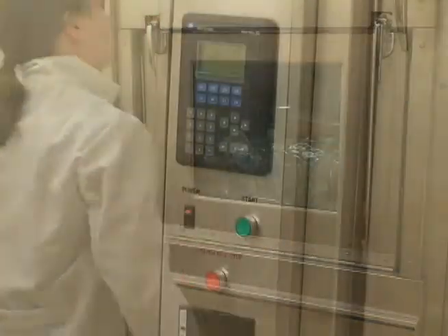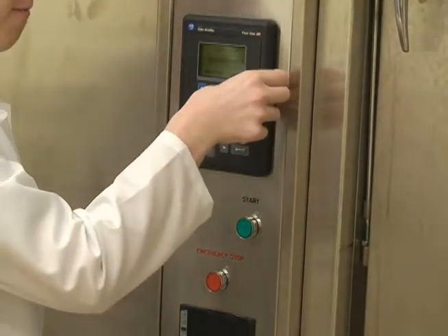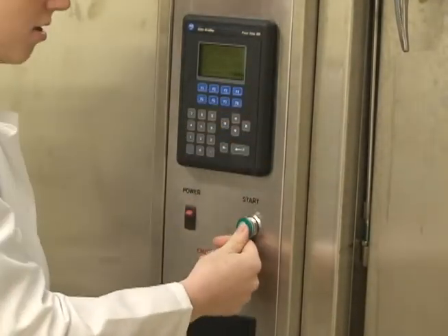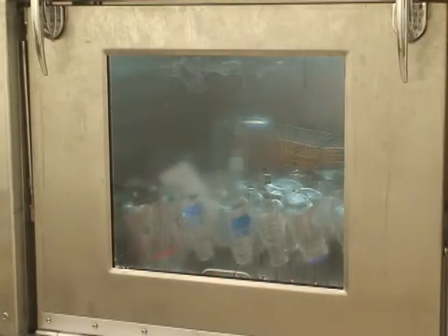Once the door is locked, you should press F4 and then start. There are other settings that you can use, but if you're just using a basic wash, this should work for you. The manual has instructions on other settings.